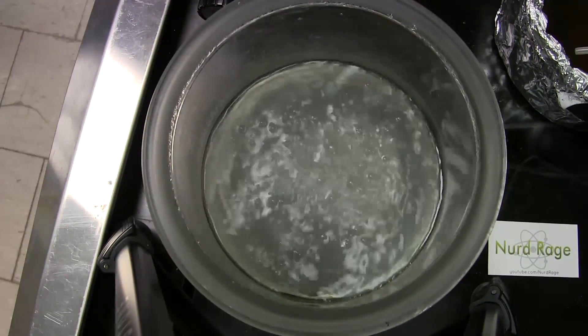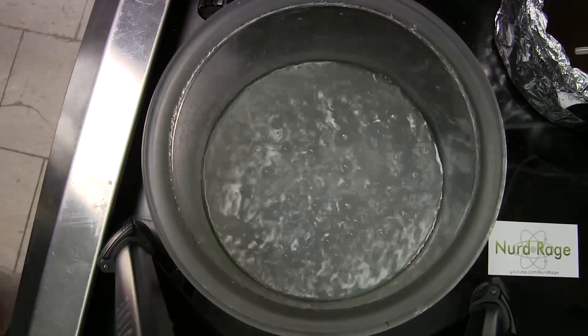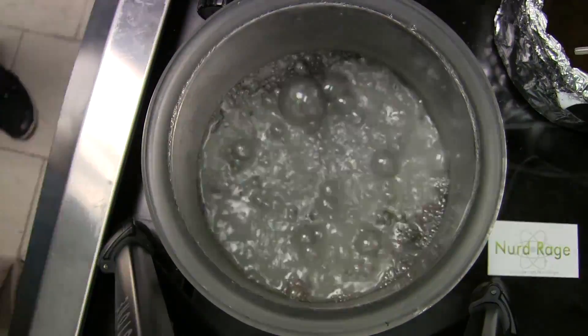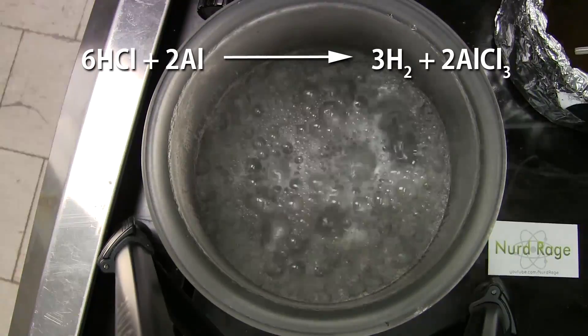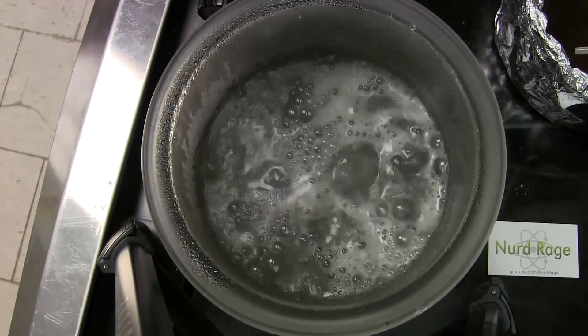And there we go. A hard drive is mostly aluminum metal, so the primary reaction is hydrochloric acid on aluminum, generating hydrogen gas and aluminum chloride. Of course there are other metals, but aluminum is the main one.